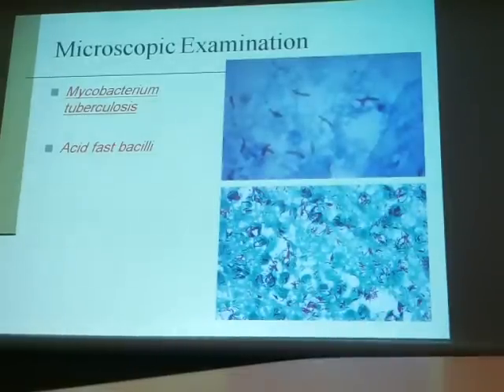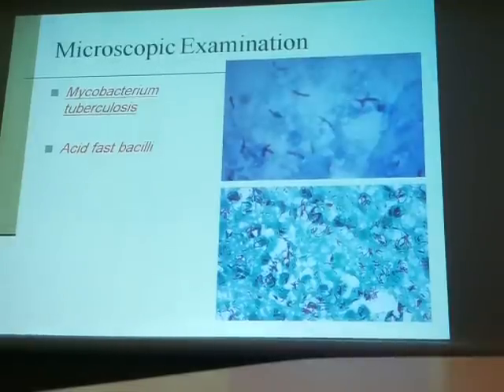Now if even one bright red bacillus appears, this means we have significant infection of TB. We consider that we have infection with TB. A positive result has red bacilli due to the carbolfuchsin, because Mycobacterium tuberculosis has a waxy layer in the cell wall, so it keeps the color of the carbolfuchsin stain.